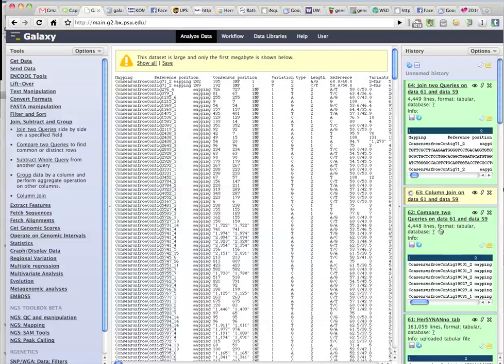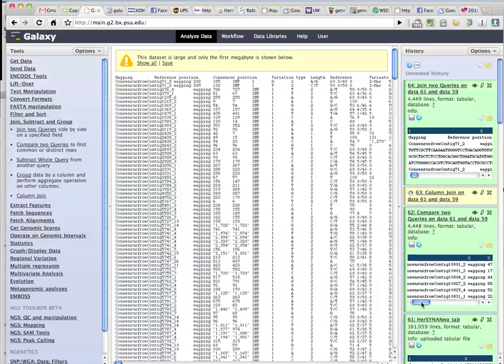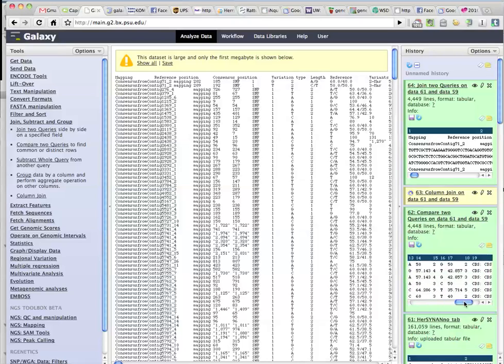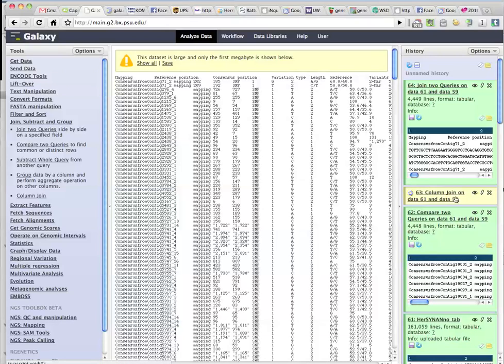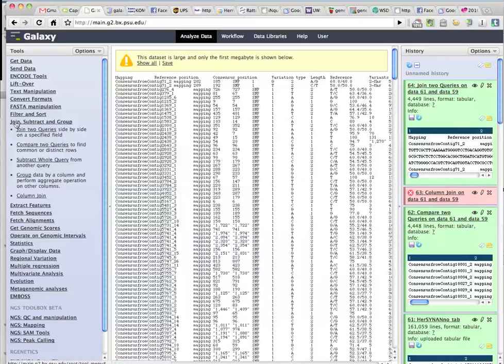So actually the compare two queries isn't exactly what I wanted. It just said which rows were found in both, which doesn't really help me. Column join still working. Well, there appears to be an error, but the join two queries under the join subtract group is actually the right thing.